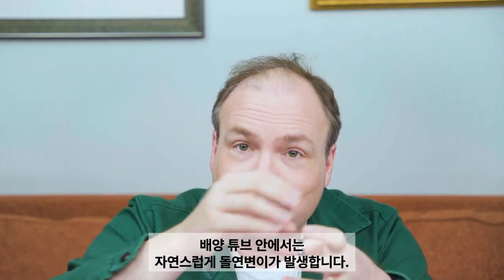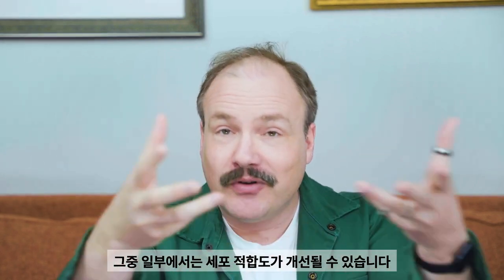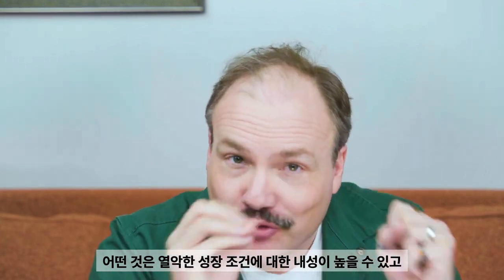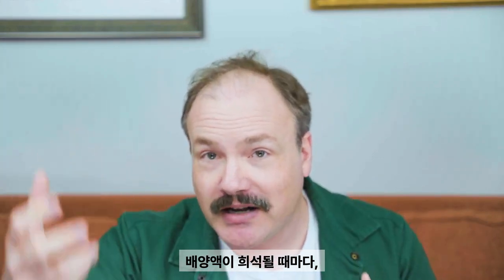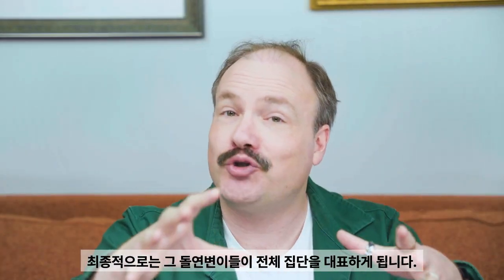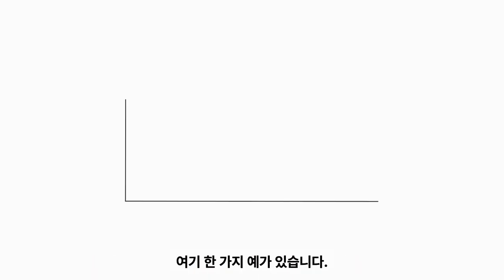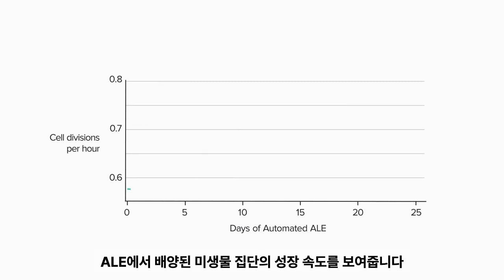Within the culture tube, mutations emerge spontaneously, some of which improve the fitness of the cells. A mutant might use nutrients more efficiently, might be more tolerant of hard growth conditions, or something else that improves the overall growth rate. Every time the culture is diluted, the faster growing mutants increase their share until eventually they represent the entire population. Here's an example showing the growth rate over time for a population of microbes under ALE.